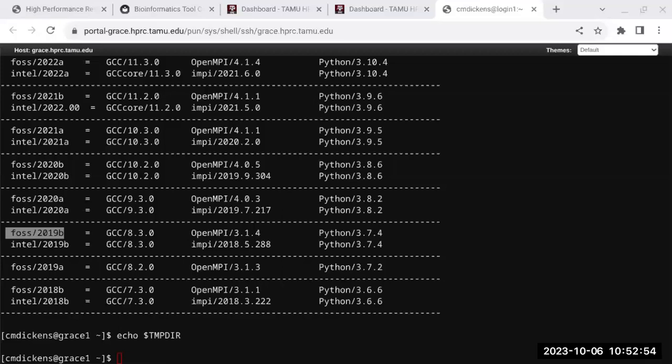Basically what it does, if in the overlapping regions one of the bases doesn't agree in both reads, it takes the highest quality score of the base, and it will correct the others. Or if it can't determine, it will put an N in there. You can merge those reads with BBMap, or you can error correct without merging.